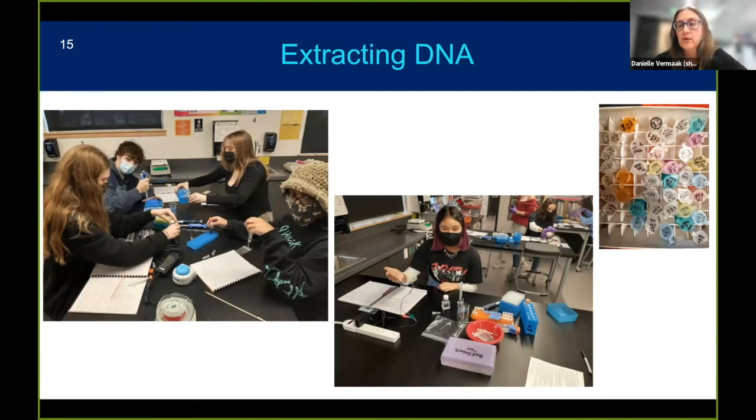We did have to do this step a few times, and with some samples we just weren't successful, but in the end we did extract a whole lot of DNA from different things. There you can see students. Initially we were thinking one group would do one sample, but we ended up with everybody processing at least two, because our reagents were cheap, so we could do it a few times and really try to get a diverse set of samples.